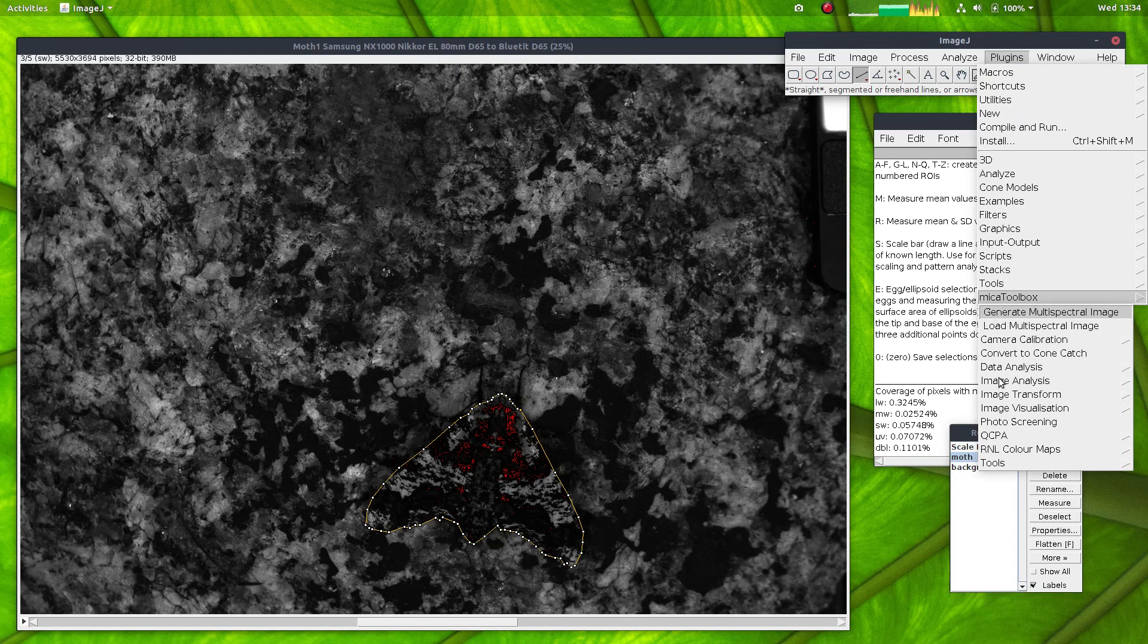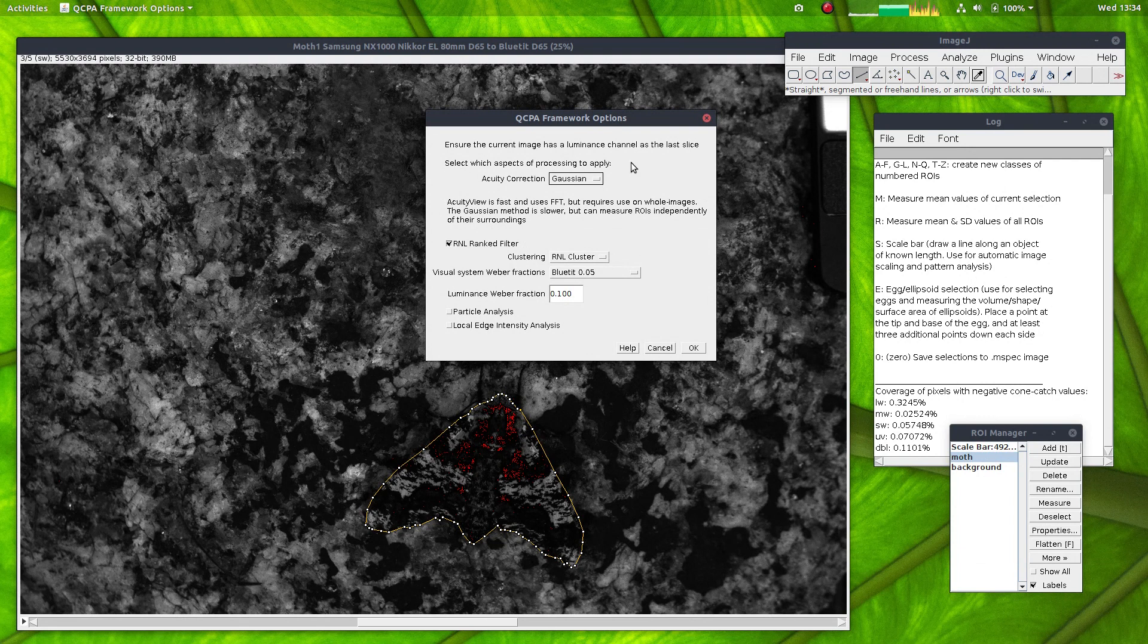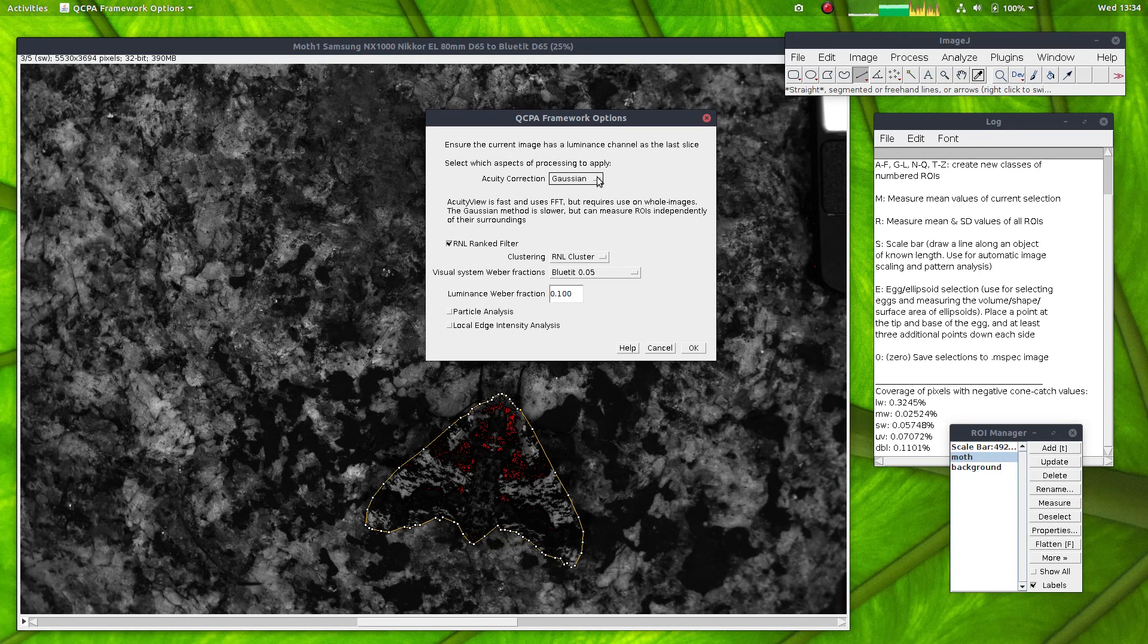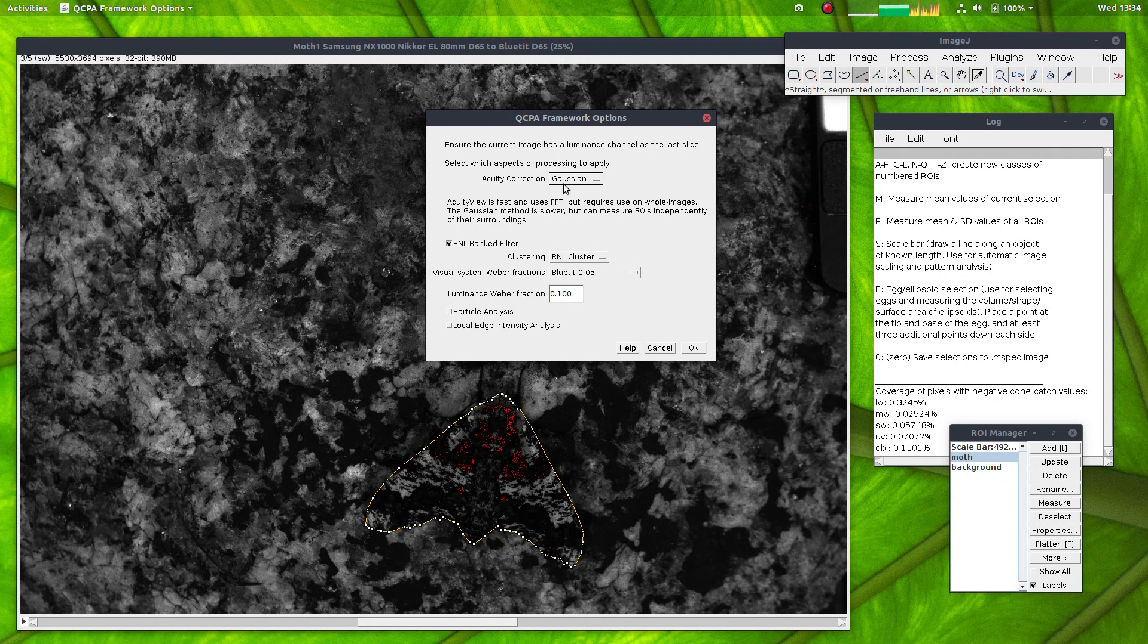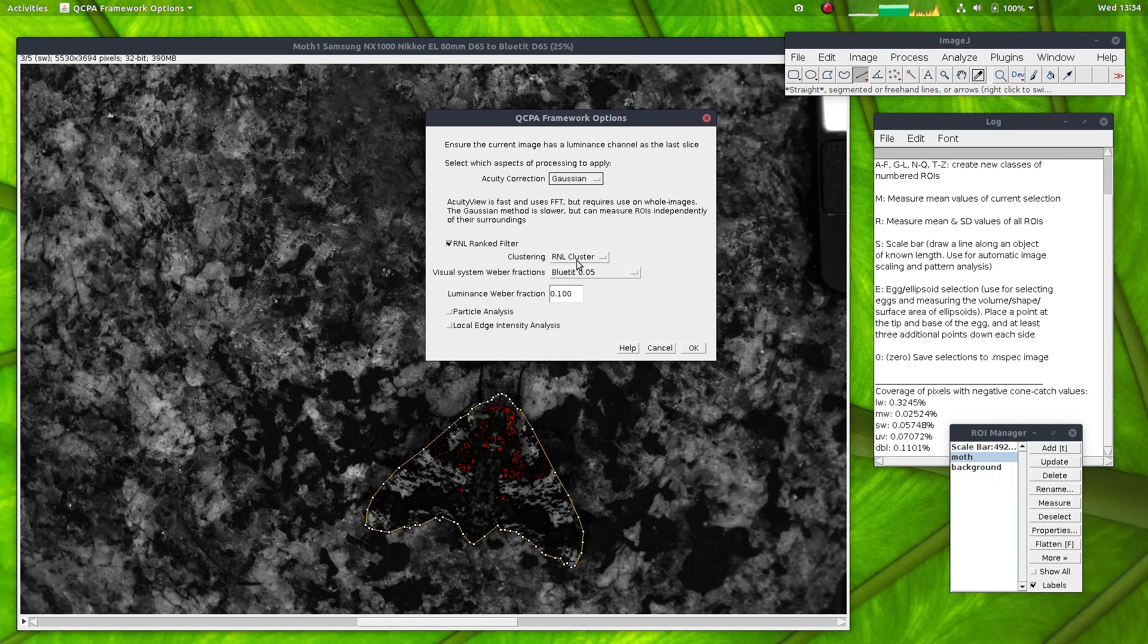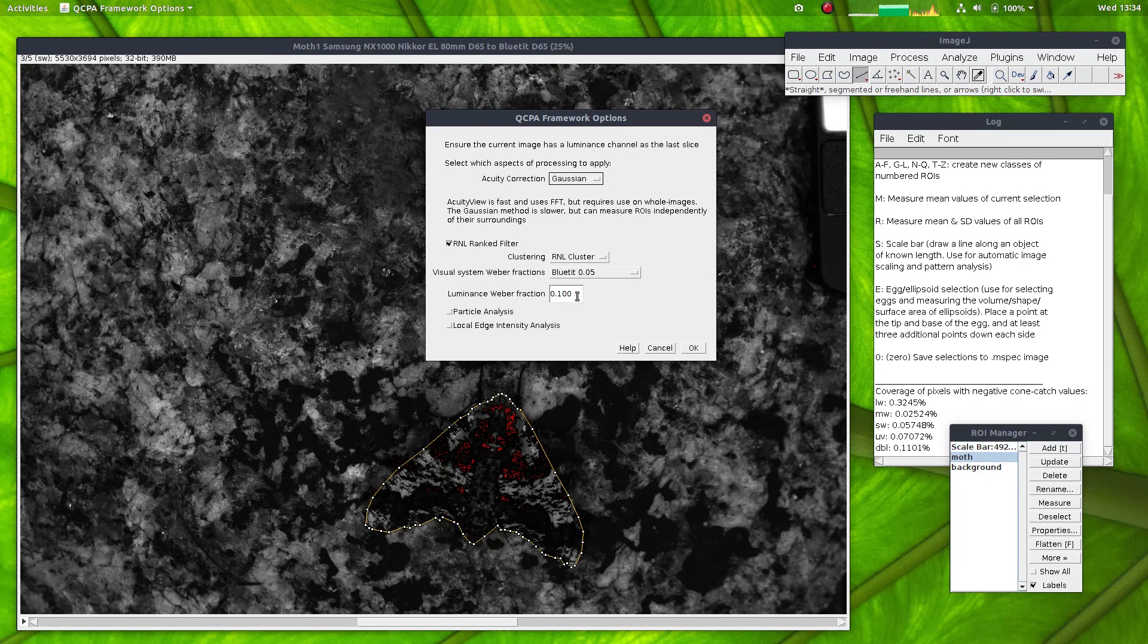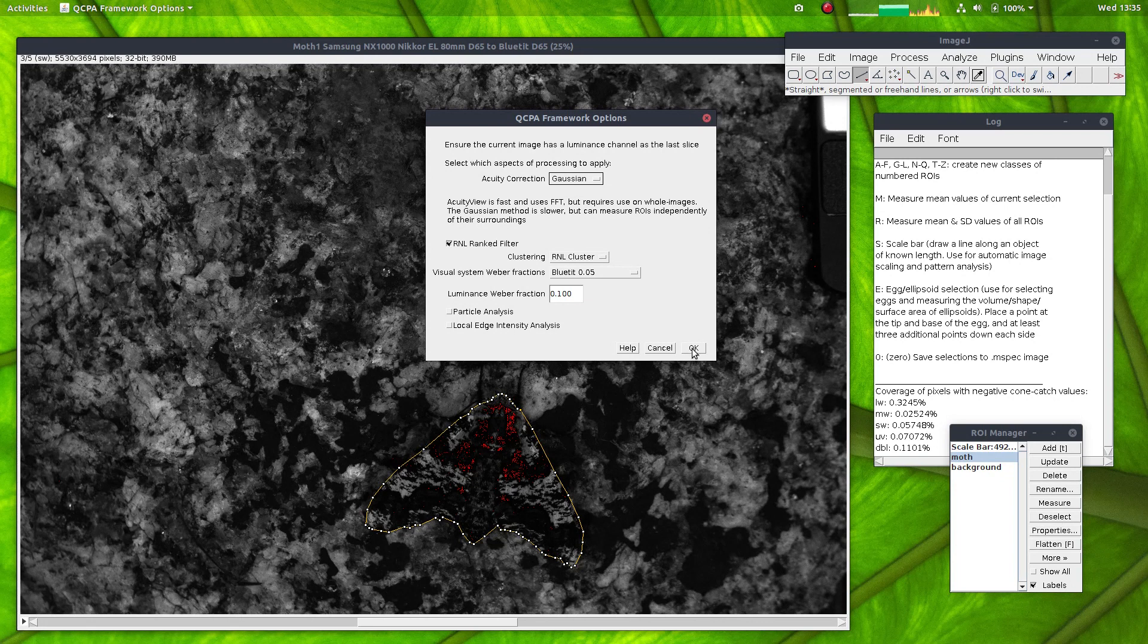To do that, I just need to go run QCPA framework. I'll start by showing the different options demonstrating measuring the whole image. In this example, I'll use a Gaussian acuity correction because the Gaussian can deal with regions of interest that aren't a rectangular or square shape.